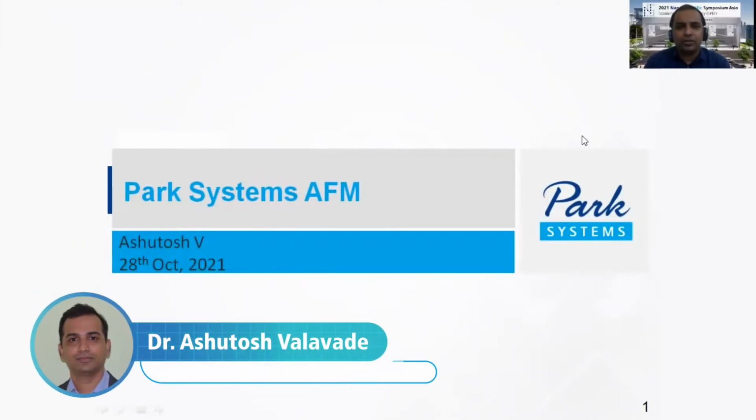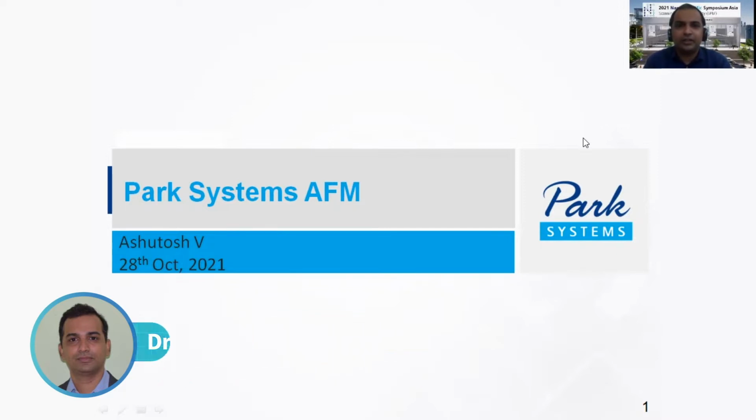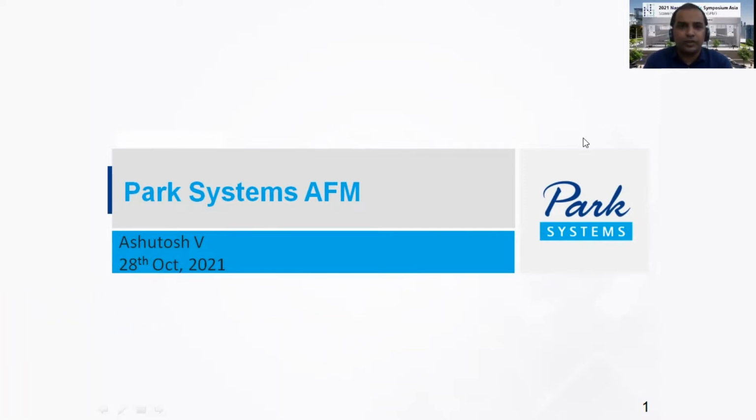Hello, my name is Ashutosh, and I'm here to talk about a very popular technique in atomic force microscopy, which is called electrostatic force microscopy, or EFM. This talk will provide you an overview on how to get information about electric properties of your sample surfaces using EFM.